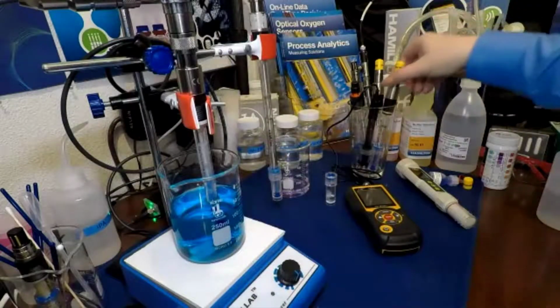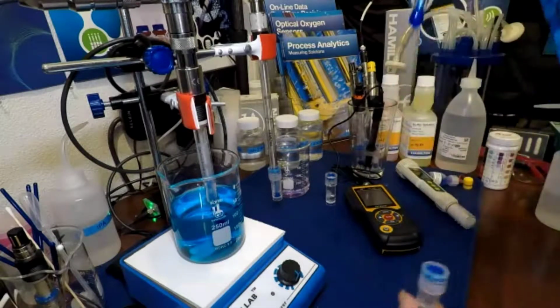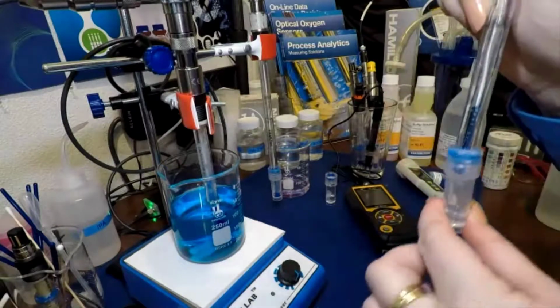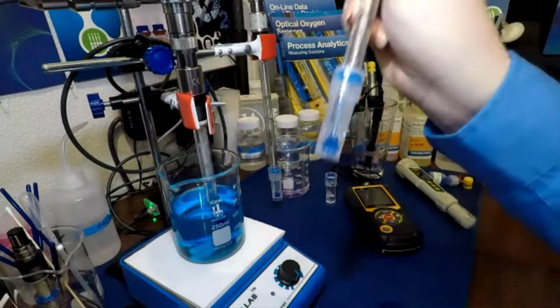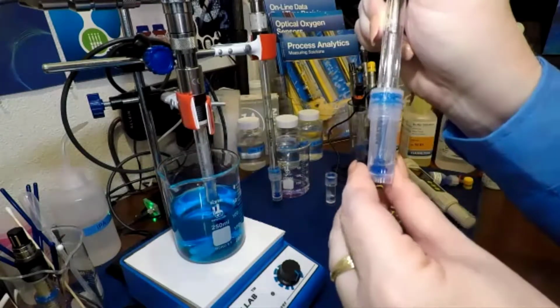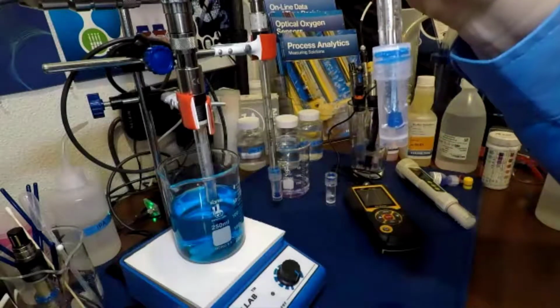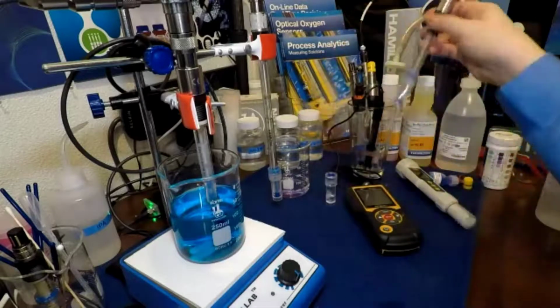When you're storing your pH probe or you're putting your probe in something, you should never rest your probe so that it is lying down on the bottom of something. It should never be sitting all the way to the bottom. It should always be up in the air, surrounded by liquid. That means you should never sit it in a conical tube, just sitting in the bottom.